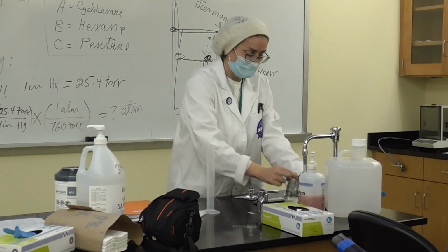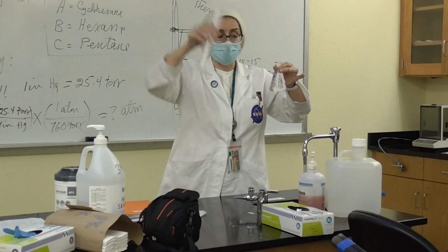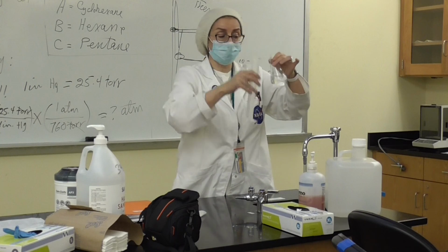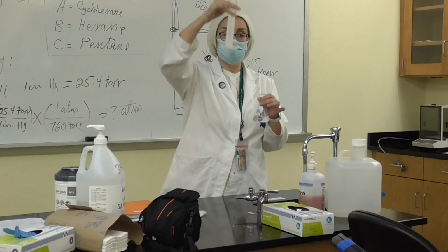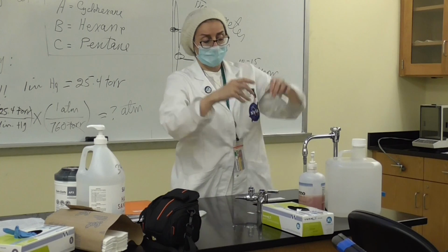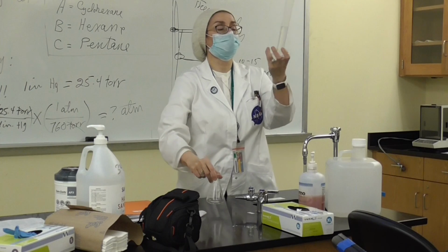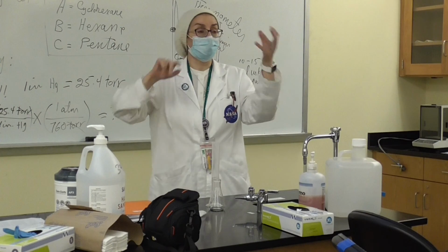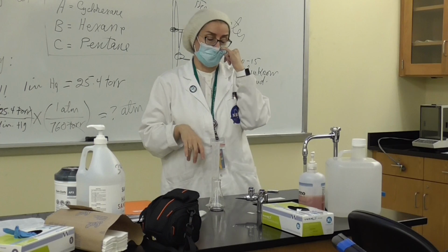You see here? Everything is here to the rim, okay? Take this cylinder and then weigh. All right, this is more than 100. So we have 100. And then, after you measure the 100, I throw it, and then I measure the rest. So the rest, if you look at it here, I have this particular one, 150. That is the volume of your conical vial, or Erlenmeyer flask.